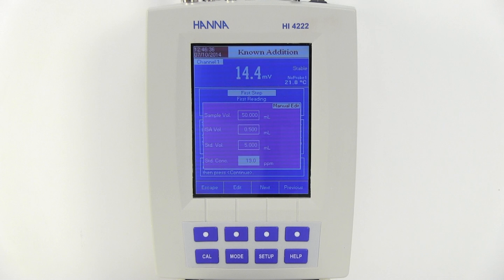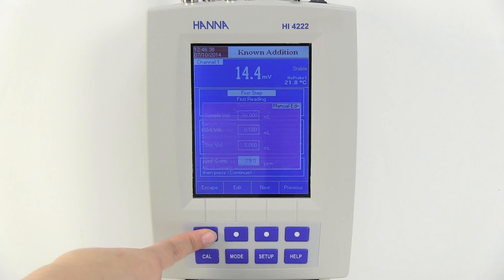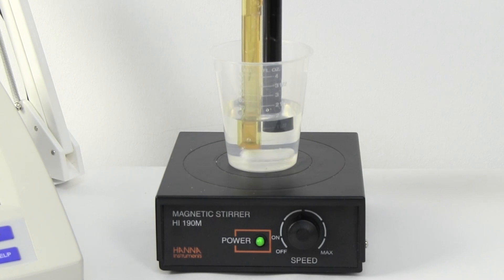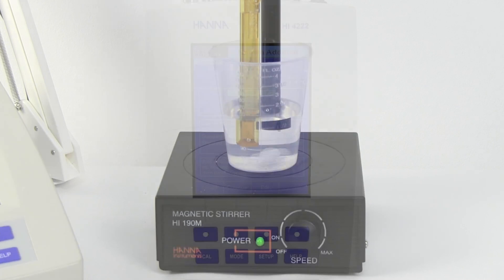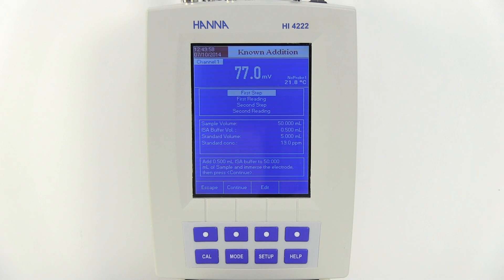After all these parameters are set and solutions prepared, press Esc. Submerge the ISE probe and the reference electrode into the solution. The sample should be stirring during the measurement. The screen should be at the first step stage. The meter will prompt you to add 0.5 mils of ISA to the sample.